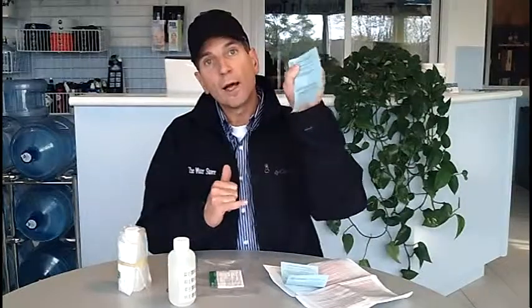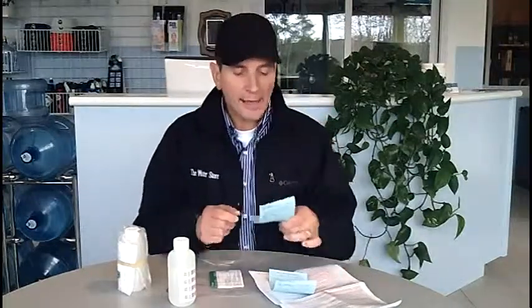Then one of the barcodes you peel off and stick on this blue piece of paper here. This you're going to keep, because you're going to use it to call in in two or three days' time to check your water test results.